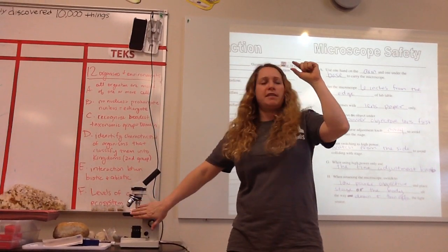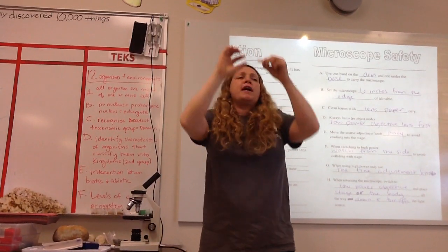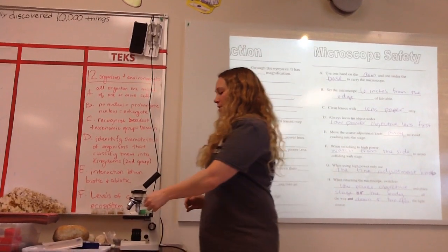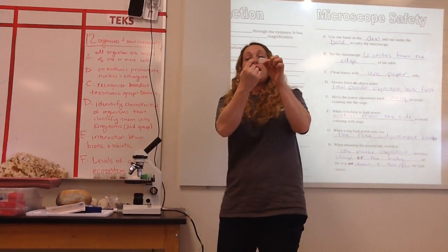Before you put it on the stage, you should look for the object by looking up at something white or something light and look for the little dyed object. Remember that it's microscopic, so it's tiny. If you don't do that and you put the slide on, the object might not go over the hole, and then when you go to look for it, you won't be able to find it. So you want to make sure it lines up right with the hole.